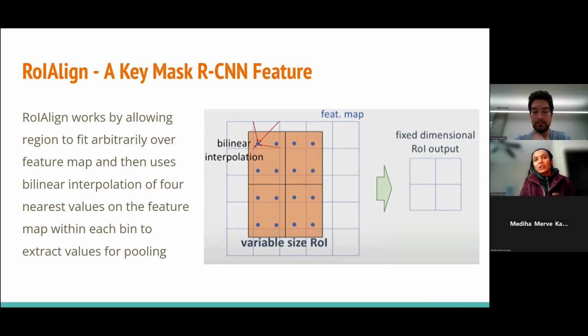Maybe there could be something called padding. Have you heard about padding? Kind of adding some extra length that the stride goes over. Yeah, I'm not sure, I haven't really looked into that much, but I imagine you're still going to run into an error if it's rounded off, in the sense that the size of the regions you're looking at is arbitrary, right? So you could have some extra, but then you might also be extracting too much information from something outside of the region. So you kind of have to play with the padding and finely tune it to get accurate enough. Whereas I feel like this is a little bit more stable, at least in the idea, in the sense that you're always going to get less information from just outside the region of interest and more information from just inside the region of interest. But you're still going to be getting information from those edges.